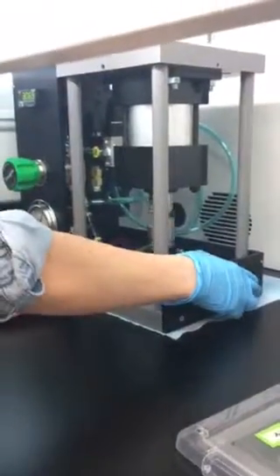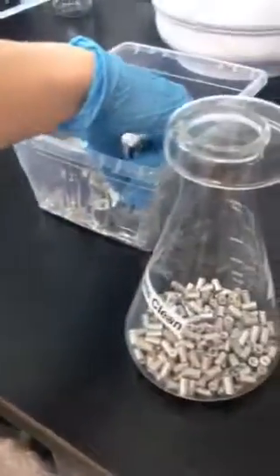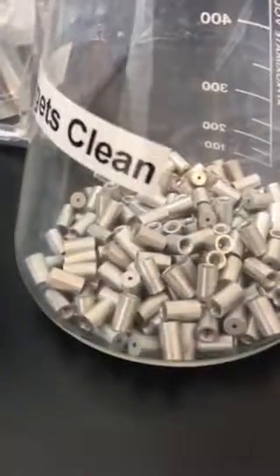So now you've got your sample in here, and then it goes over to the pressing module and you press it. And so at the end of this stage, you're going to have one of these aluminum targets with your sample pressed into it.